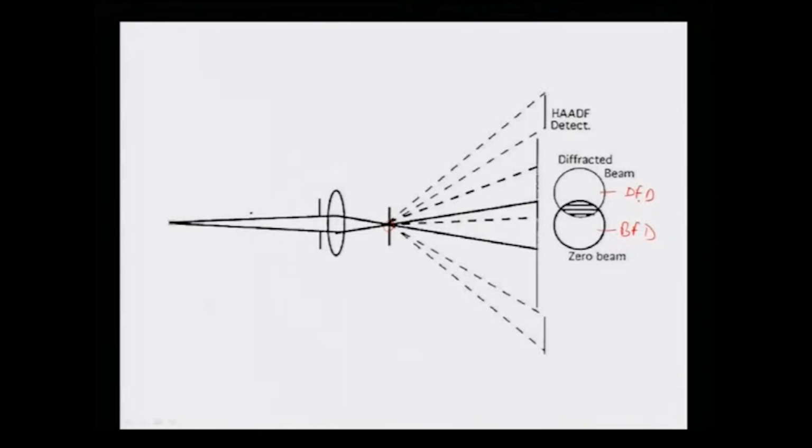Not only that, one can integrate, as I said, the STEM with the electron energy loss spectrometer, which allows you not only microanalysis of the specimen, in a very small area, to detect elemental presence or the state of different elements present in the sample, but also allows you to form images with electrons that have lost a particular amount of energy.